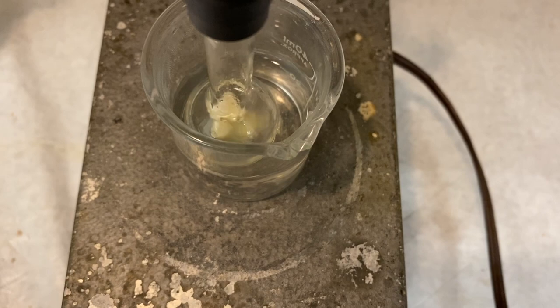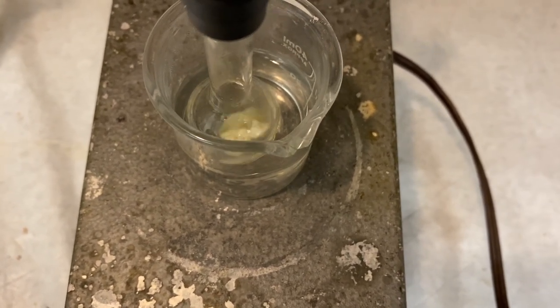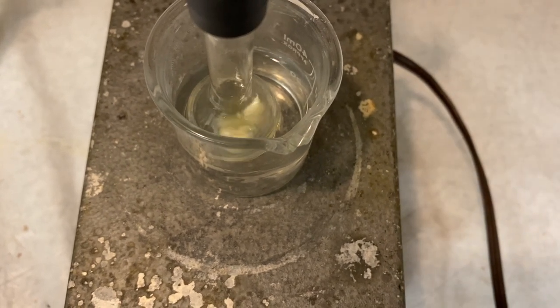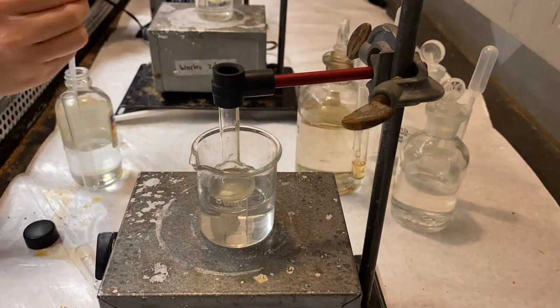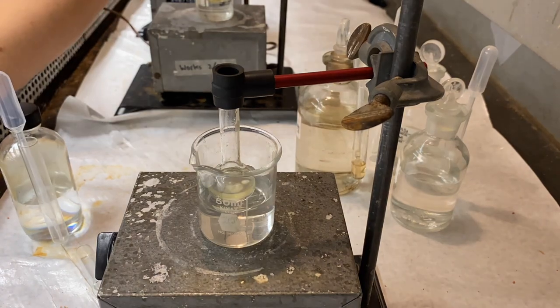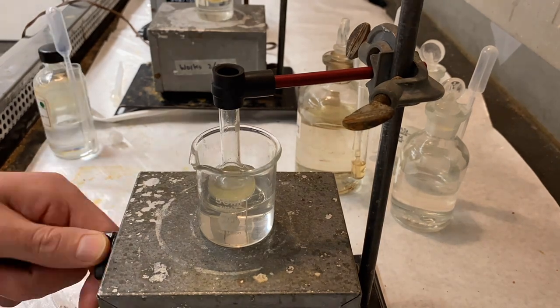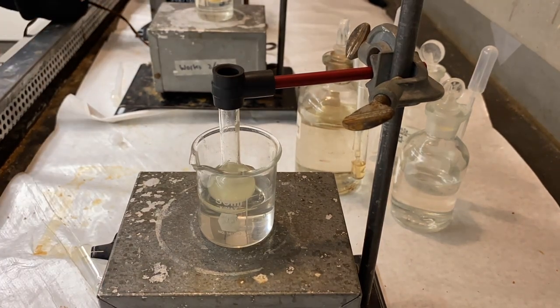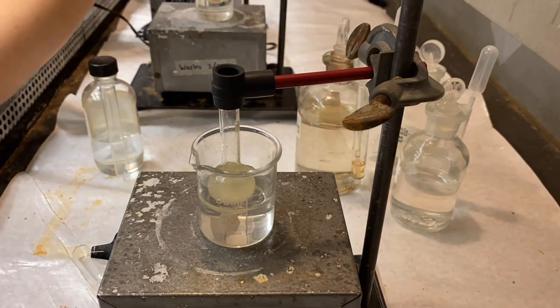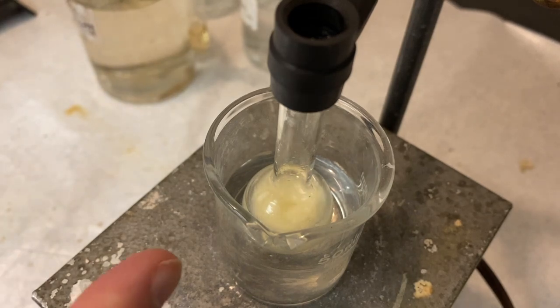So let's just keep going and add the second milliliter slowly. And then we'll move on from there. So we've finished adding all the bromobenzene that we needed. And then we've waited an additional ten minutes. And you can see that we have some solid in the flask.